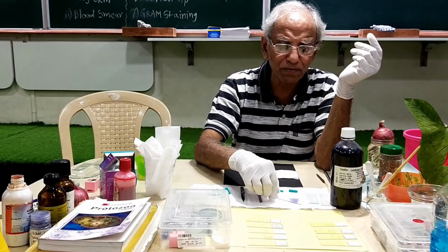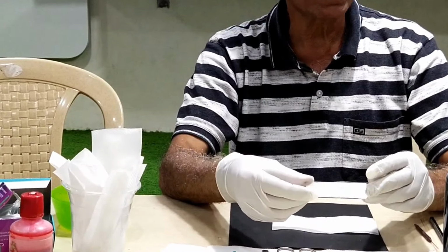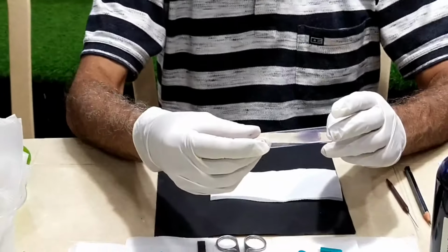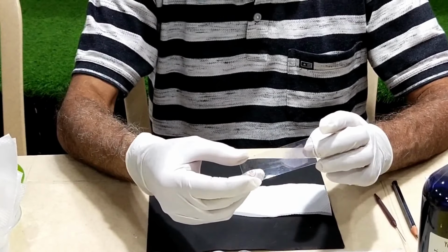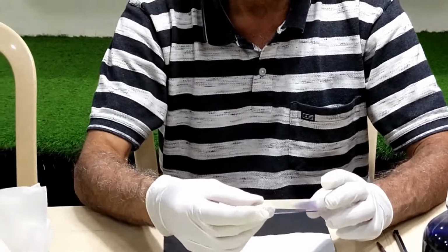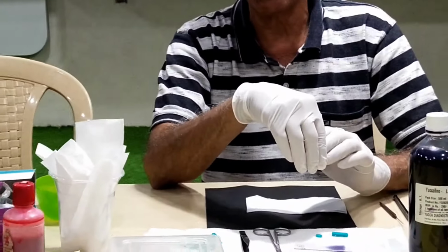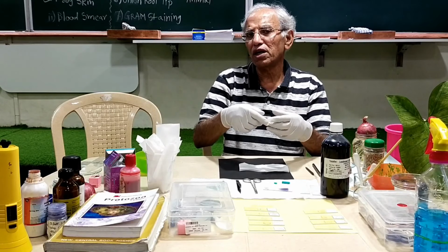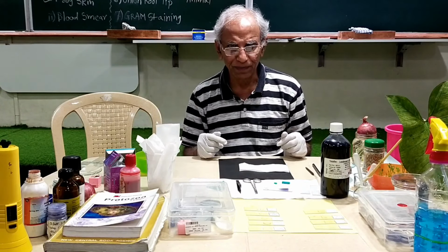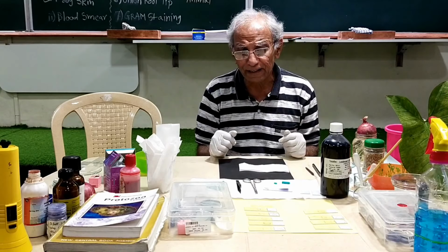Here is one slide which I can show you. Can you see this particular stain? This is purple colored. This is the slide which already has been made here using Leishman stain. We can show this to you, okay. But actual steps of the Leishman staining we are not going to show you. So what we are going to do, we are just helping you to observe the making of a smear. And this directly can be put under the microscope and you can observe the red cells.